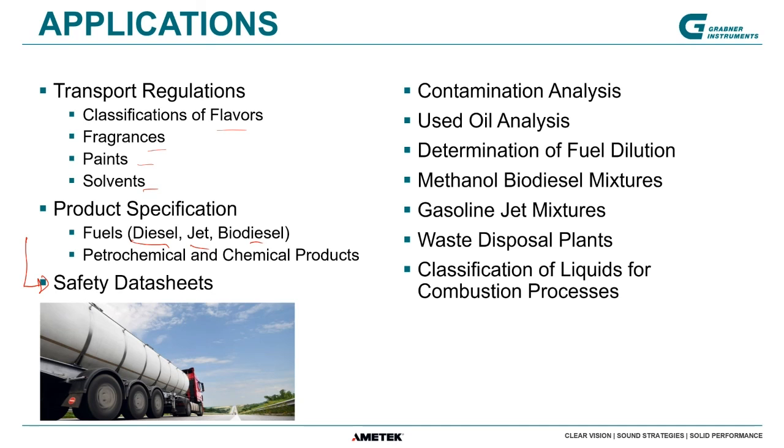What else is done? You can do combustion analysis, contamination analysis, determination of fuel dilution. That's a big application the military is using, because the flashpoint is a very fast and efficient way to see if you have any gasolines contaminated into diesel fuel or any light fuels going into lubrications and so on.